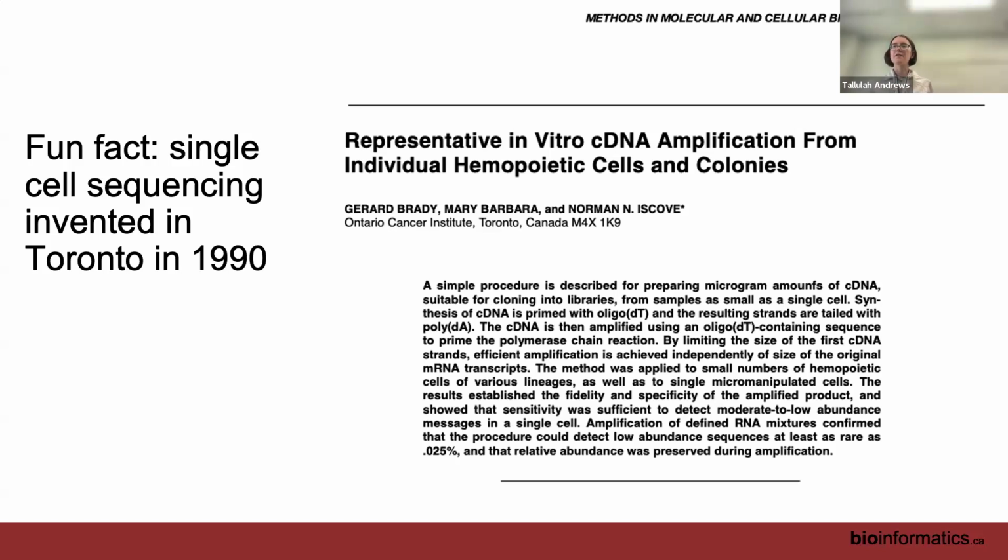Oh, we have a completely out of topic question from Ottawa, which is integrating different omics data sets. So this is another case where it's very annoying that people use the word integrating for lots of different things. So integrating different omics data sets, it depends on which omics data sets you're talking about. So for bulk RNA-seq and single-cell RNA-seq, usually what you're doing is deconvolving the bulk RNA-seq using your single-cell RNA-seq.